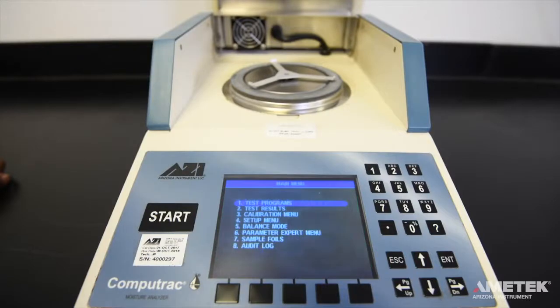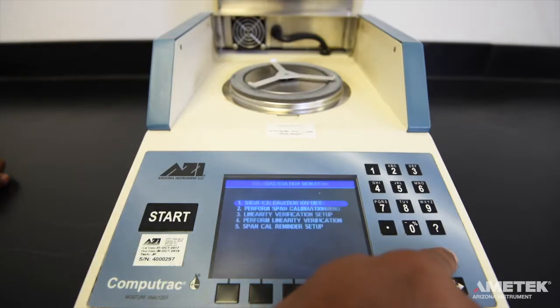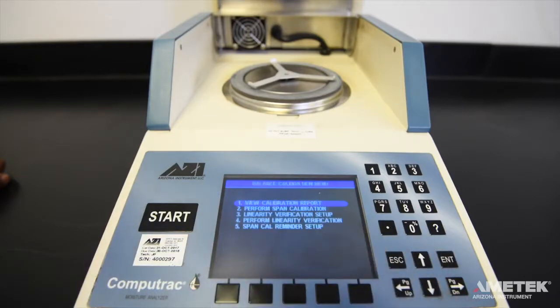From the home screen, press the menu button. Use the directional keypad to the right of the screen to highlight calibration menu and press enter to select it. You are now in the calibration menu. Select balance calibration to enter the balance calibration menu.